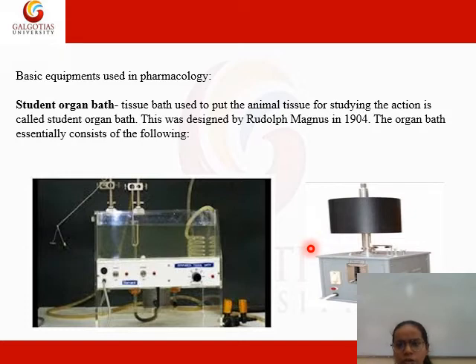While using the Sherrington rotating drum and kymograph, ensure that friction between the writing tip and the drum is as low as possible. The friction must remain constant throughout the experiment. The writing tip must be rigid.